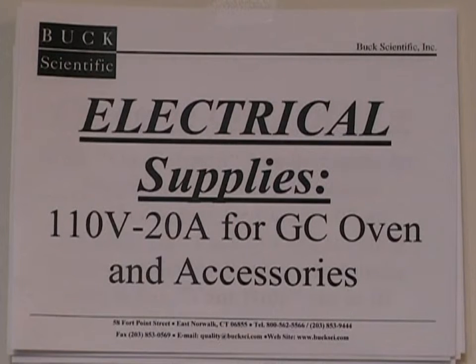For routine operation, a 20 amp 110 volt supply of electricity should be sufficient to allow the GC to be programmed to its maximum temperature. This represents the highest draw that the system will usually make on the electrical supply, but occasionally 10 amp or 15 amp services will be sufficient.